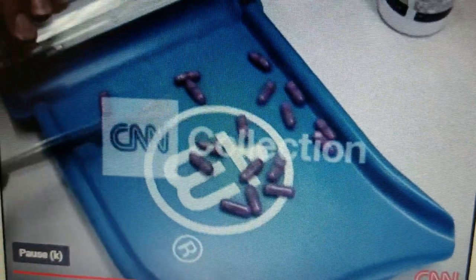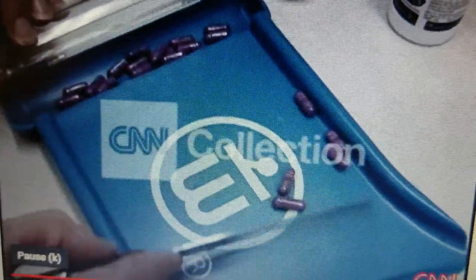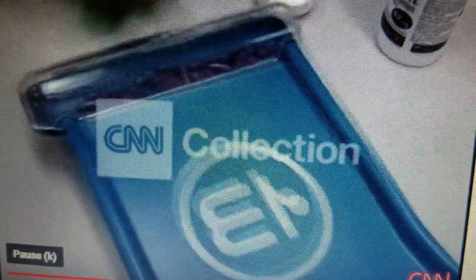So we're going to count by fives. 5, 10, 15, 20, and then back into the bottle.